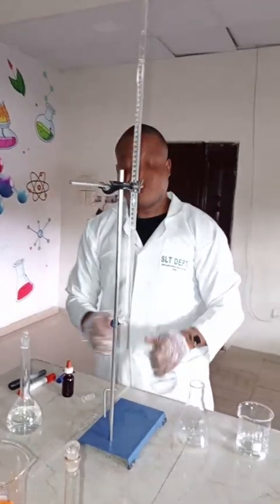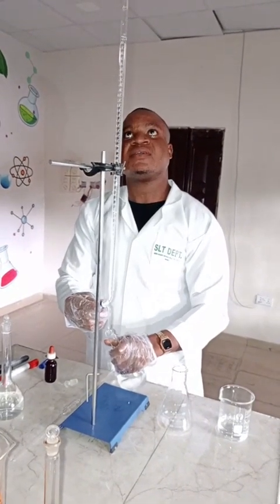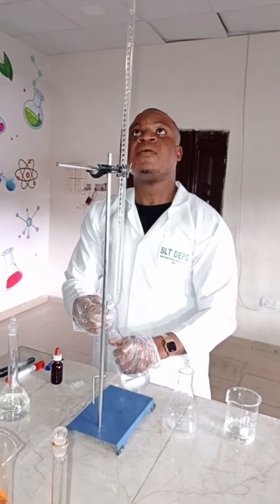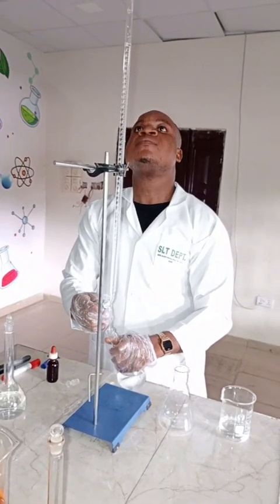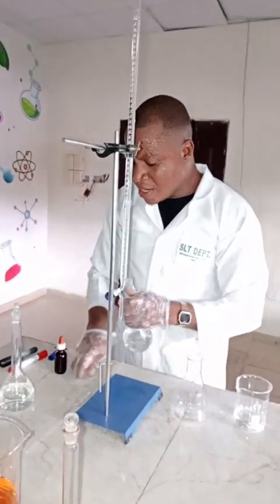Now that is above. I'm going to release it. Now this is the 0 mark.